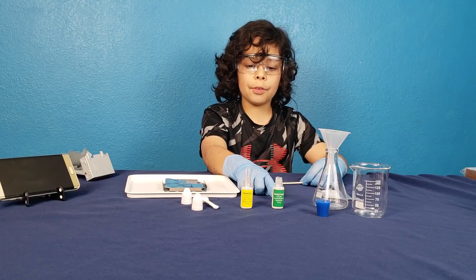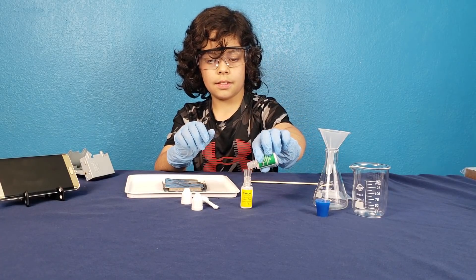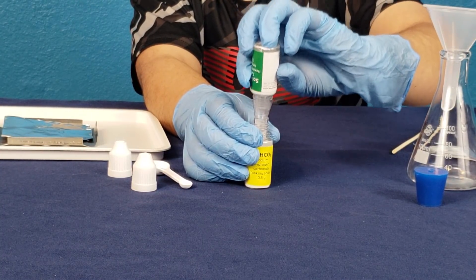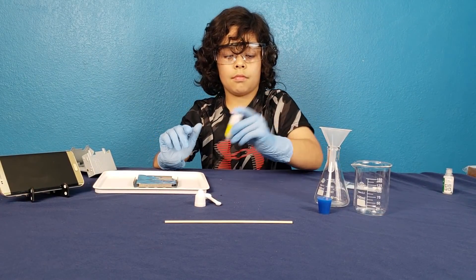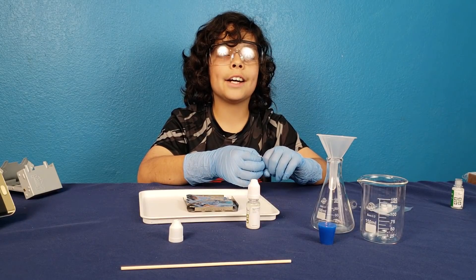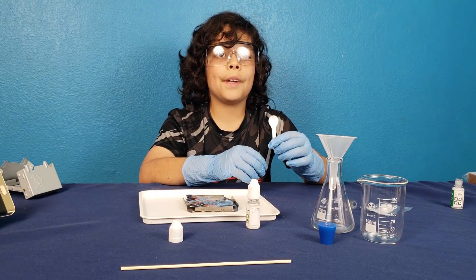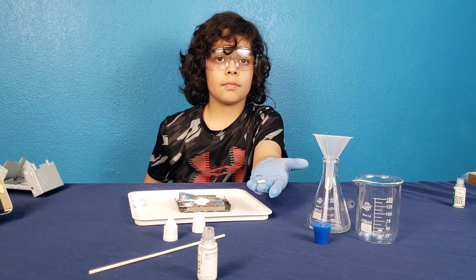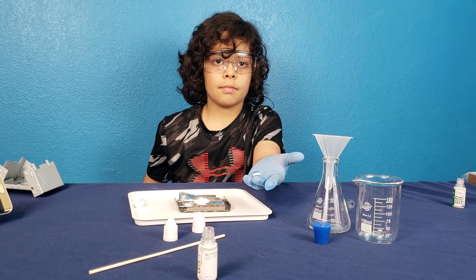We're going to put the solid fuel into the baking soda. Now that it's mixed, let's shake it up. Now the powder is all mixed up. We're going to put one big spoon onto the foil. Now that we have it on the foil, we're going to put the tablet of calcium gluconate on there.